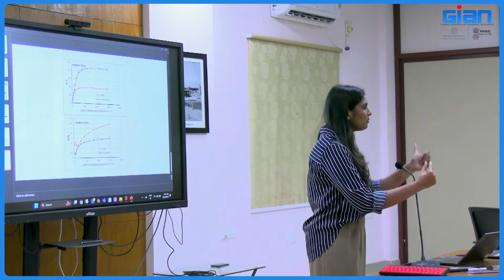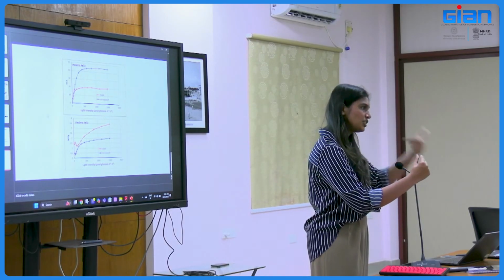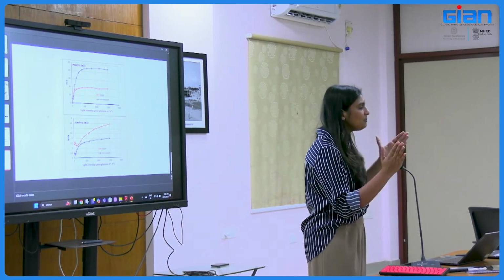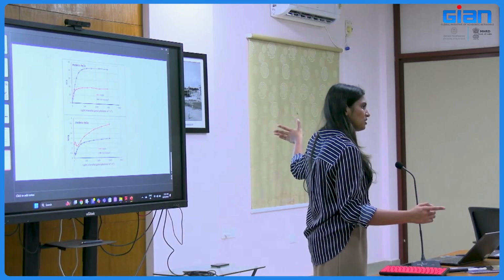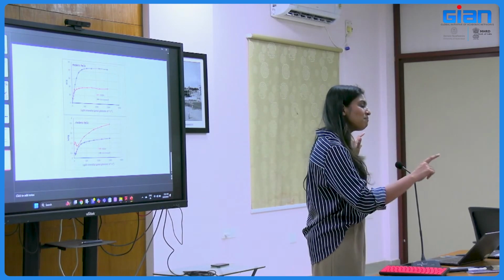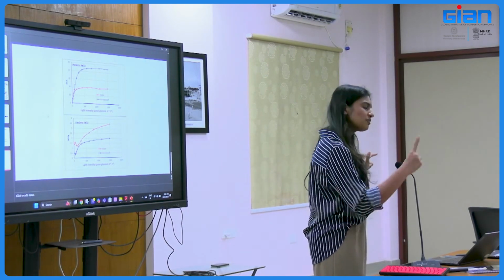Once PS1 absorbs this particular wavelength, there will be an absorbance change of PS1. Excited PS1 and non-excited PS1 absorbance will be shifted. This will be studied by the same signal processor and you get the data. So you should always remember in PAM, PS2 fluorescence will be measured, PS1 absorbance shift will be measured.